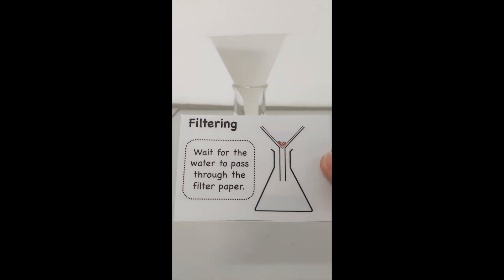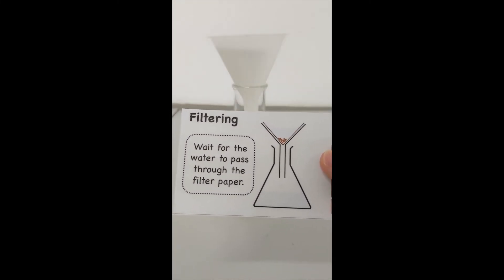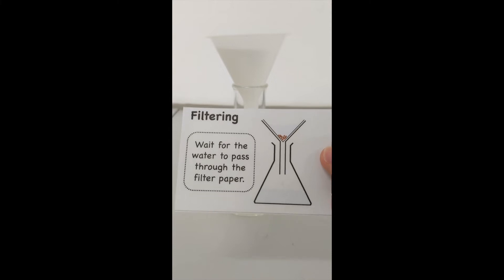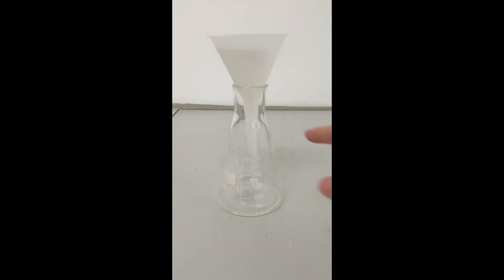Now I'm waiting for the water and the dissolved salt to pass through the filter paper. You can see this happening here. None of the sand and grit is getting through, just the salt solution—the water and the dissolved salt.